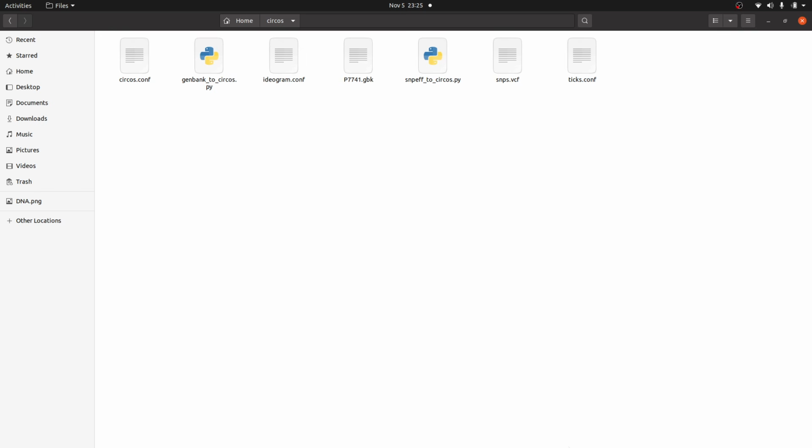Now I have tutorials that show how to perform genome assembly, genome annotation, etc. So basically, if you have a microbial genome, then I have tutorials that can help you get started. So use those tutorials to obtain this file. I also performed variant calling to get the SNPs. I performed variant annotation. So what you have here are high impact variants.